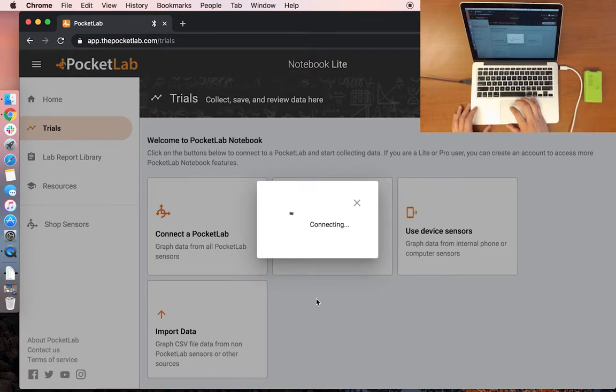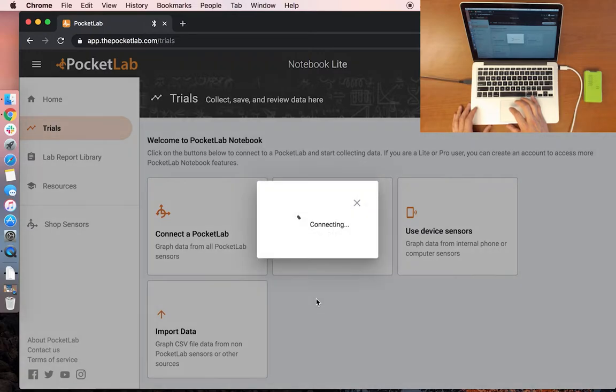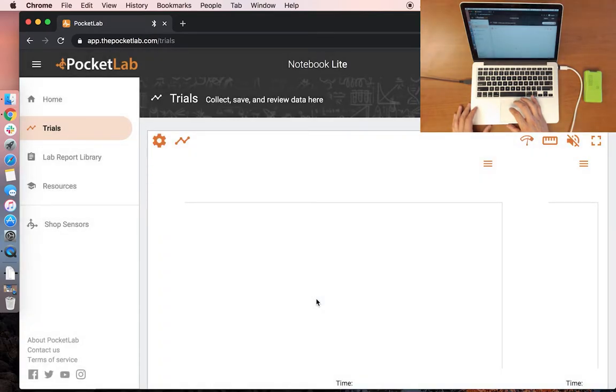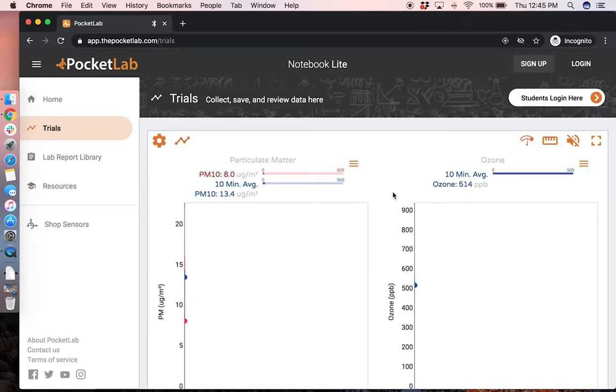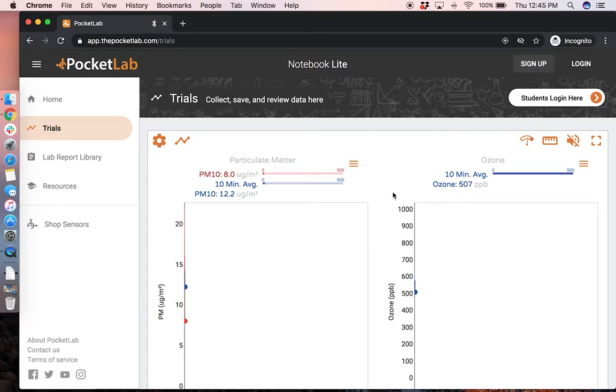There will be a connecting menu that pops up while the device is configured. Once the device has connected, you will see graphs of all the data coming from the PocketLab Air.